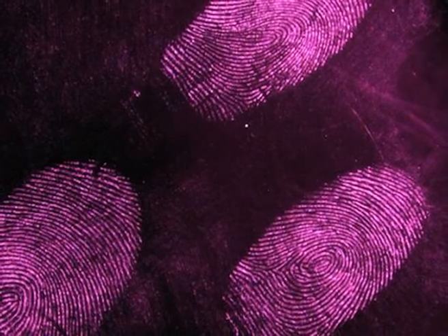The surface is illuminated with radiation of 470 nanometers wavelength and fluorescence is observed through a 570 to 600 nanometers filter. The luminescence is at its maximum immediately after the heat treatment and then decreases slightly with time due to the absorption of ambient humidity. The luminescence may be restored to its original intensity by reheating the prints.